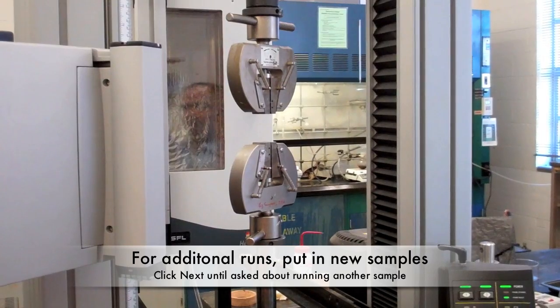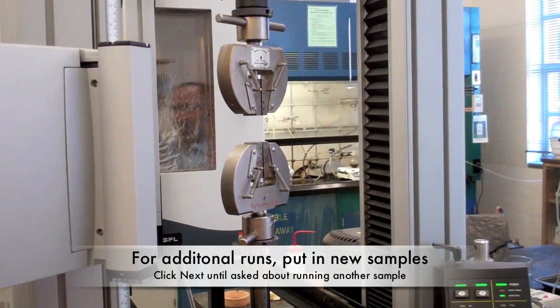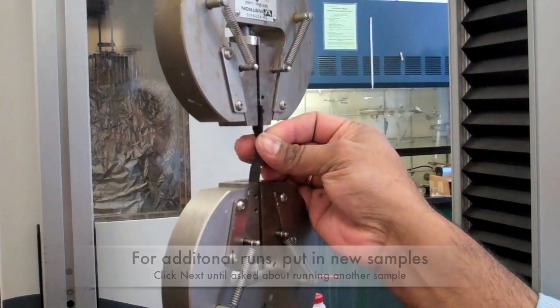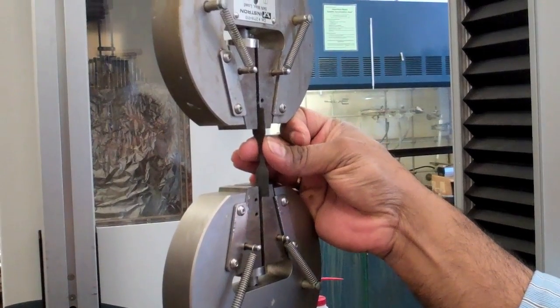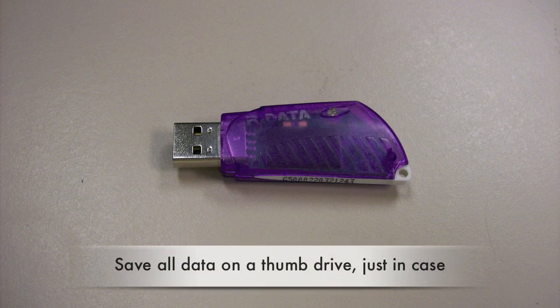For additional runs, remove the broken specimen from the clamps and replace with your next sample. Press the next button until asked if you would like to run another test under the same method. Then complete previous steps. Save all data on the thumb drive just in case data is lost.